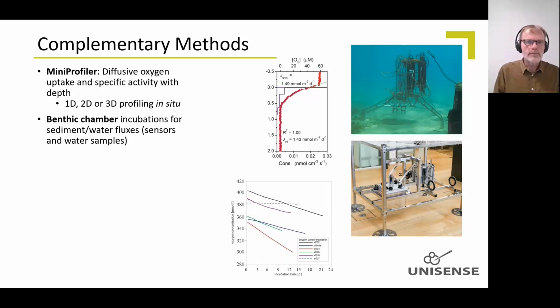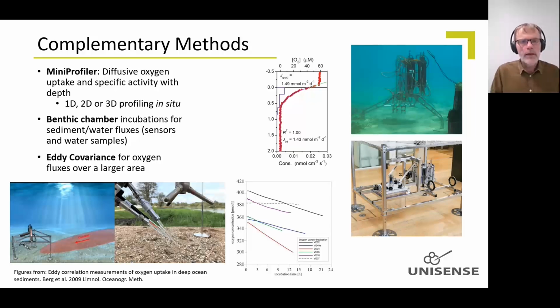the oxygen data. And then the eddy covariance technique, that typically is used for oxygen fluxes without touching anything. So it's really a non-invasive technique. The principle is that this is an acoustic Doppler current meter. It measures the flow rate and flow speed or direction, in a very small volume of water, right where the sensor tips are here. And the sensors measure the oxygen concentration.